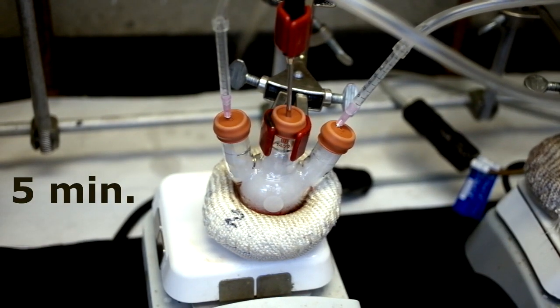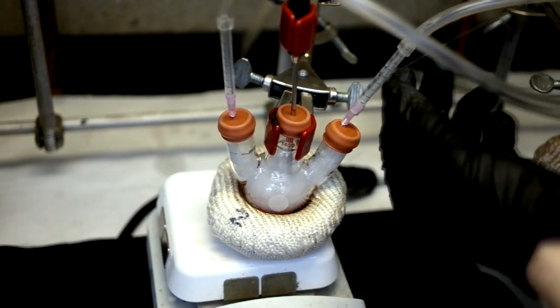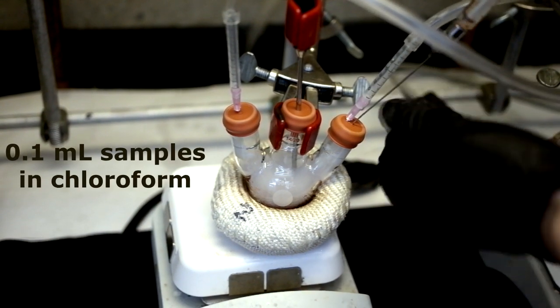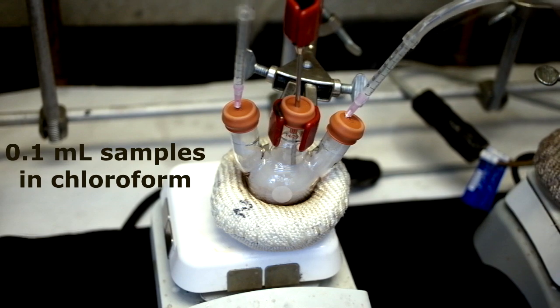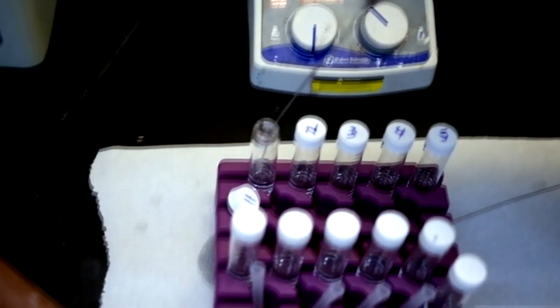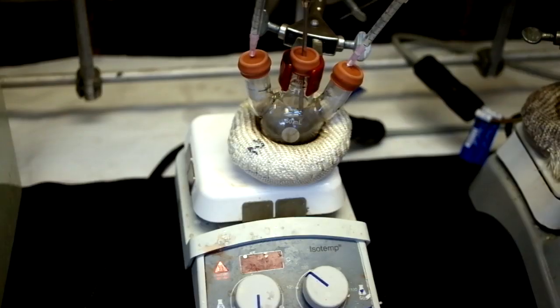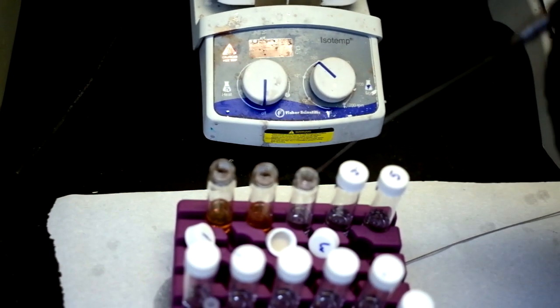Start a stopwatch for 5 minutes and immediately begin drawing samples. Use a glass syringe to draw approximately 0.1 ml samples of the reaction material, placing it into a collection flask full of chloroform. Continue taking samples throughout the reaction.